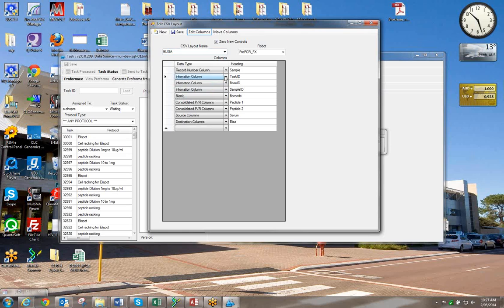So these are all just chosen. When I'm creating a new one, I just go into an old one, look at the template, write down what these columns are, and then I go and create a new one. So I'll just tell you that. These are all drop down. So I choose everything from the drop down. There's nothing typed here. Okay?